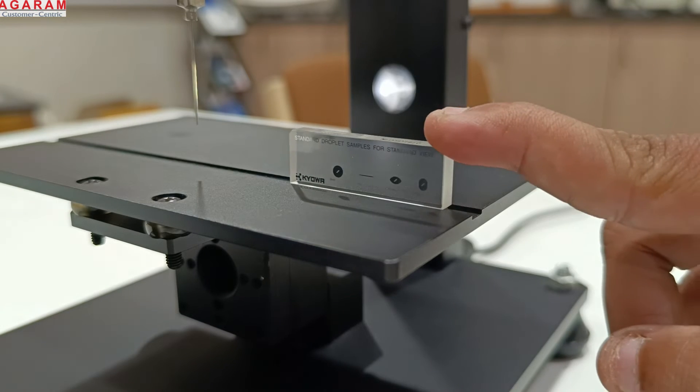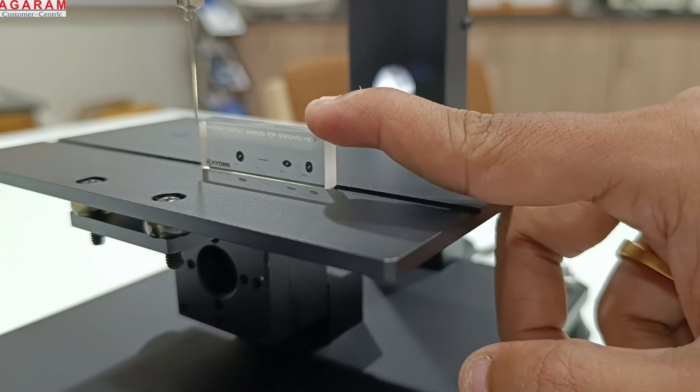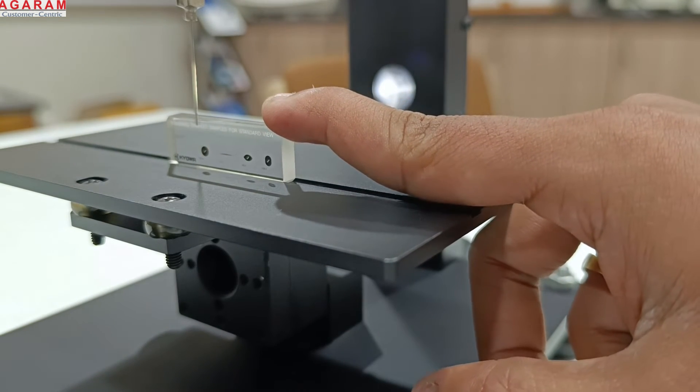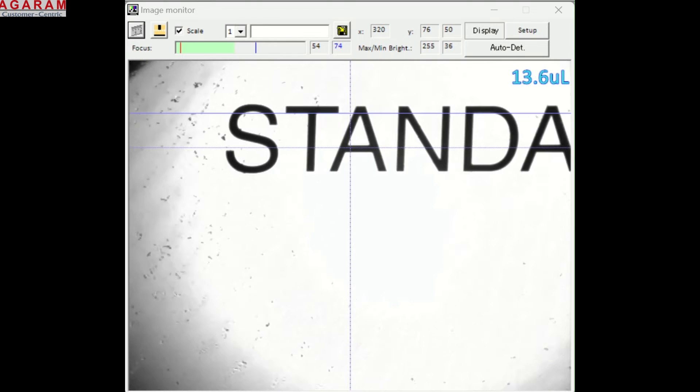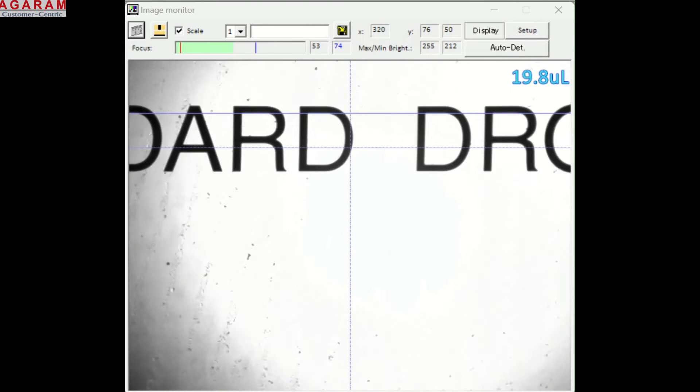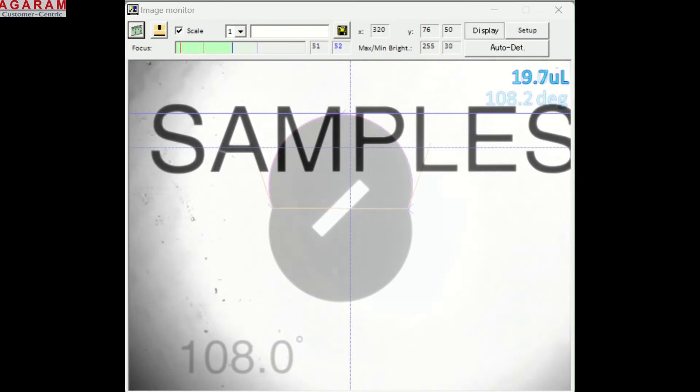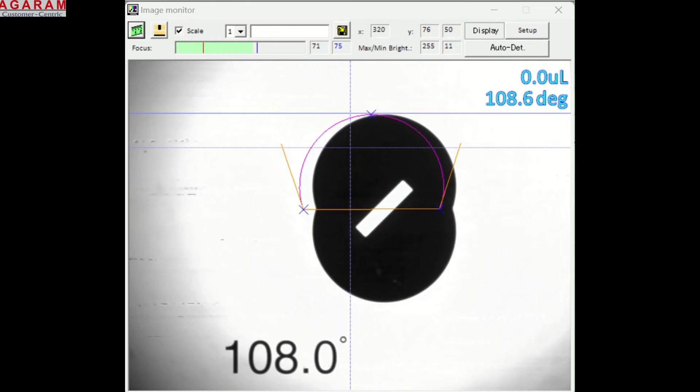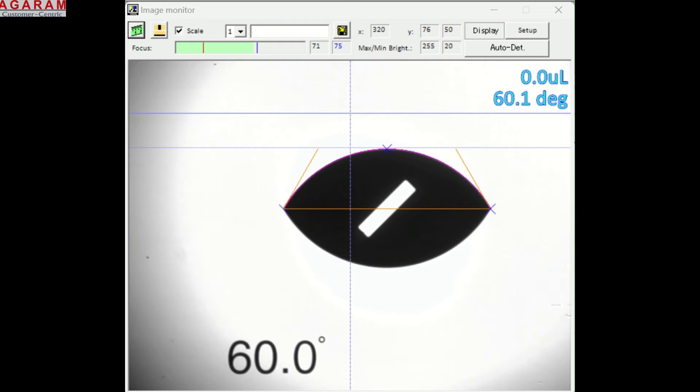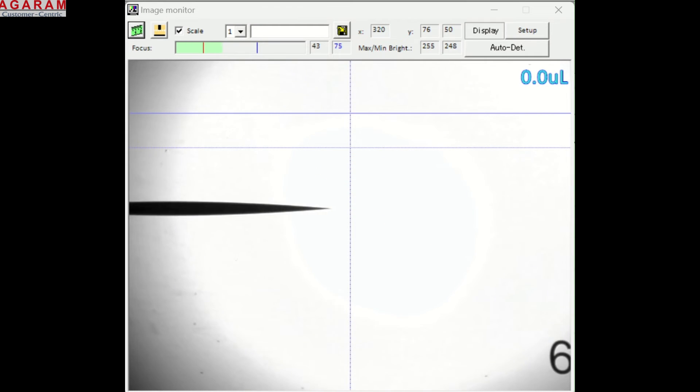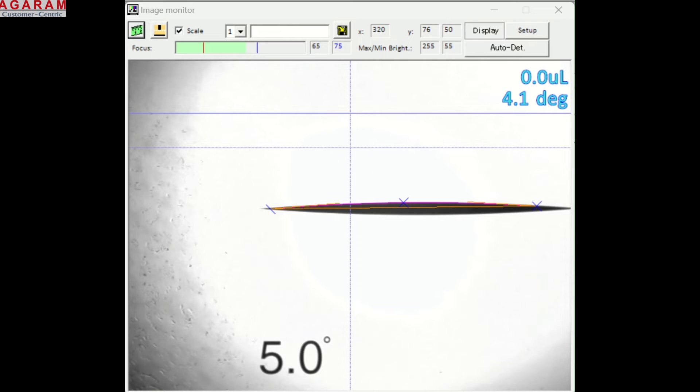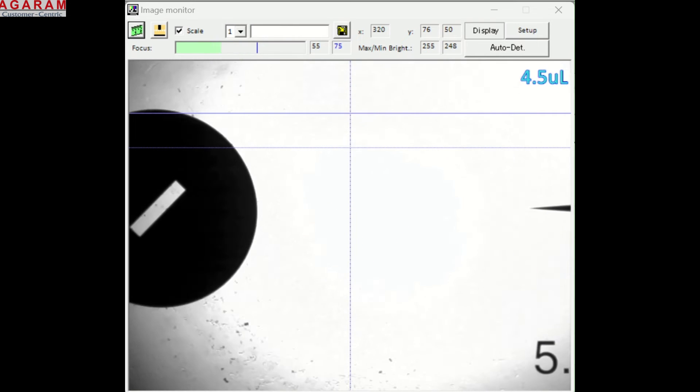With every contact angle meter, we offer a standard droplet sample. It has three droplet shapes engraved inside. These are factory calibrated and certified. Periodic inspection with these helps in ensuring the proper functioning of the machine. The pixel calibration dot helps maintain accuracy and longevity of the camera.